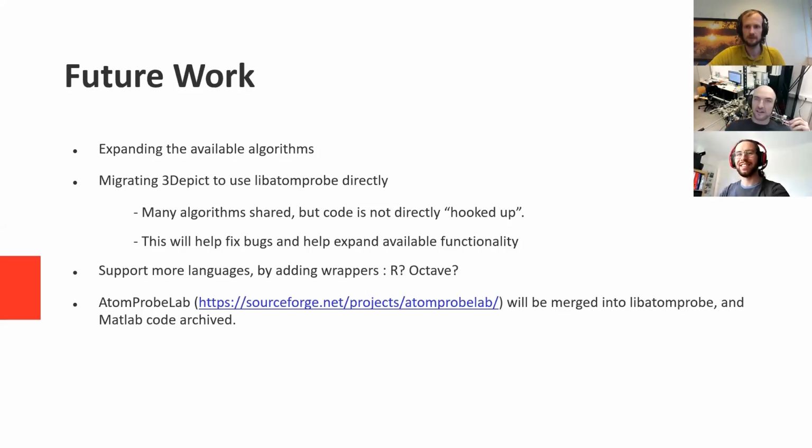Yeah, I have a question. Yeah, Peter, go ahead. So Andy, obviously, as far as I've seen, everything's command line. So what do you do with cases where user interaction, graphical user interaction is needed? Mm-hmm. So Libatomprobe is meant to be that kind of basic building block that you could call in a larger application. So we're not imagining really that someone would use Libatomprobe directly. So the Python example shows how you could integrate Libatomprobe use in a larger Python application that you were working on, or as part of your Python toolchain.